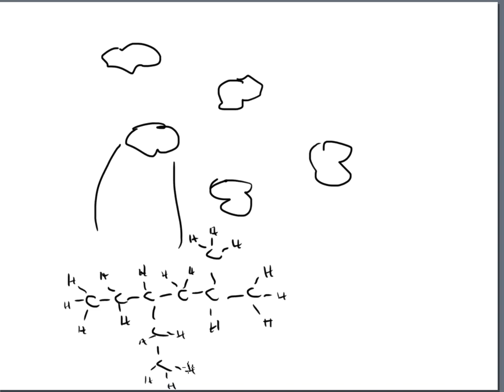So the reason that I'm bringing up the spin of the nuclei and the rotation of the nuclei and the concept that nuclei have a north and a south is for this reason. You have a molecule. That molecule has multiple hydrogens. That means that each one of these hydrogens has a nucleus. That means that every single one of these nuclei will have a rotation because every single nucleus has a north pole and a south pole.